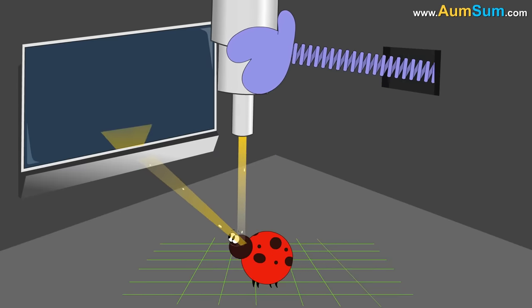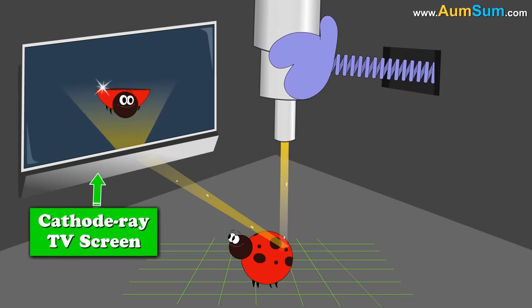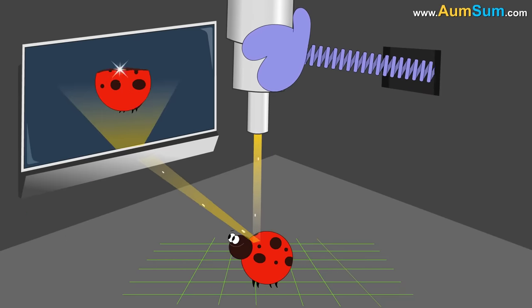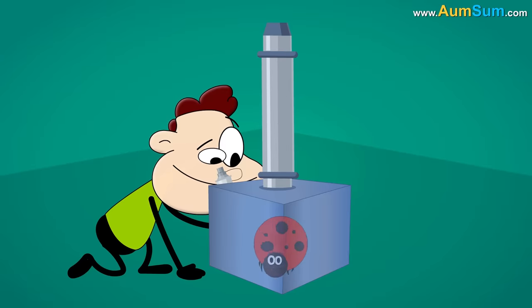These reflected electrons or secondary electrons are directed at a cathode ray TV screen. The image of the scanned object is formed on this screen. This is how a scanning electron microscope works.